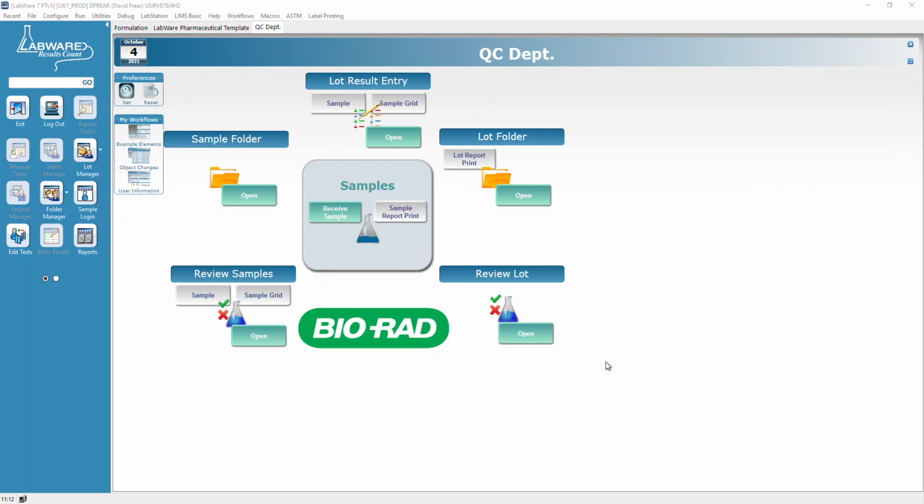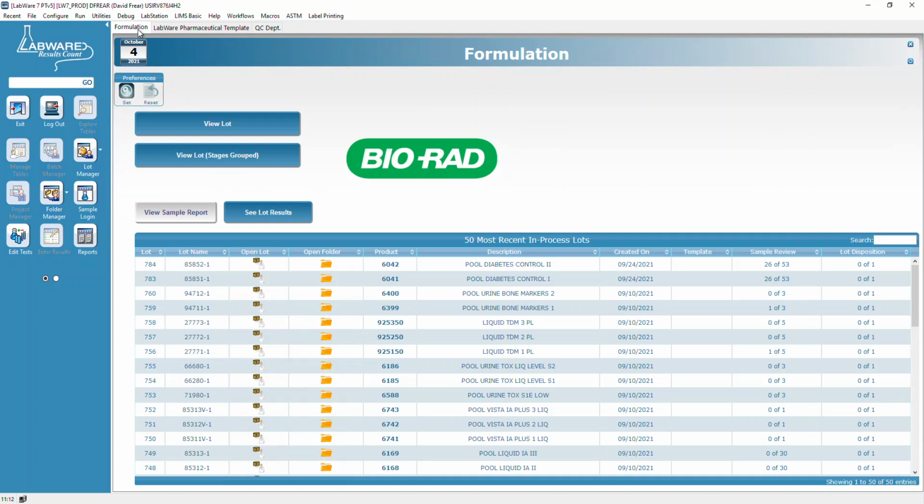Good day, all. Today I wanted to talk to you about formatted entry and results review. I've added the results review to the formulation role. And what this allows you to do is review multiple samples and multiple results at the same time.